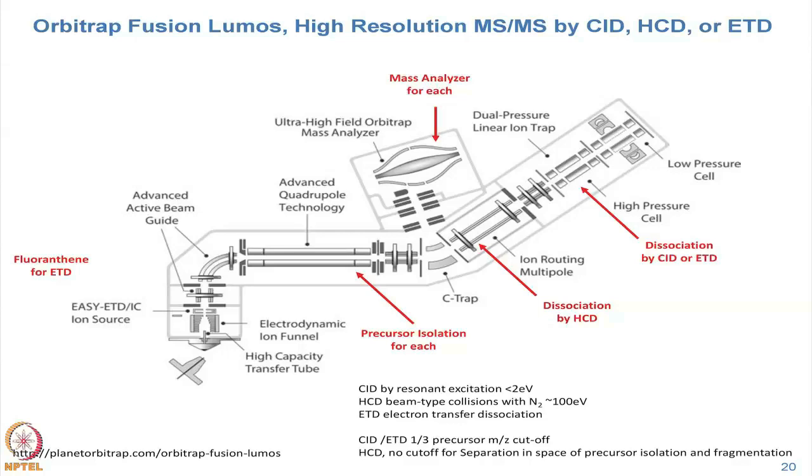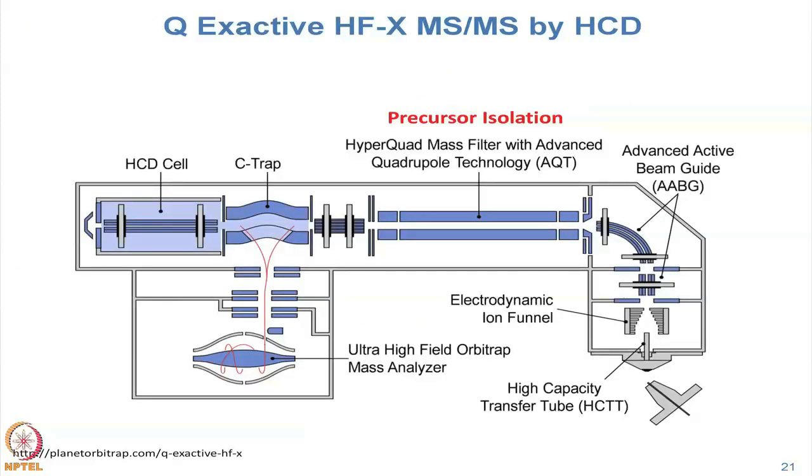In practice, in the CPTAC program for generating proteogenomic data, we generate only HCD spectra and we collect mass spectra only in the orbitrap. So we're not taking full advantage of the instrument. The reason we're using those instruments is because this instrument, which does only the things that we really want, didn't become available till just earlier in this year, and we started the grants that we were doing a year before that.